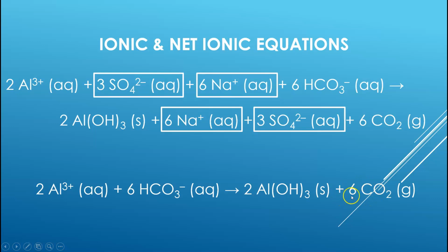So again, there's a lot going on here. It's more than your typical precipitation reaction. This actually involved a precipitation reaction, an acid-base reaction, a decomposition reaction, and the thermodynamics of Le Chatelier's principle. I hope you enjoyed the show.